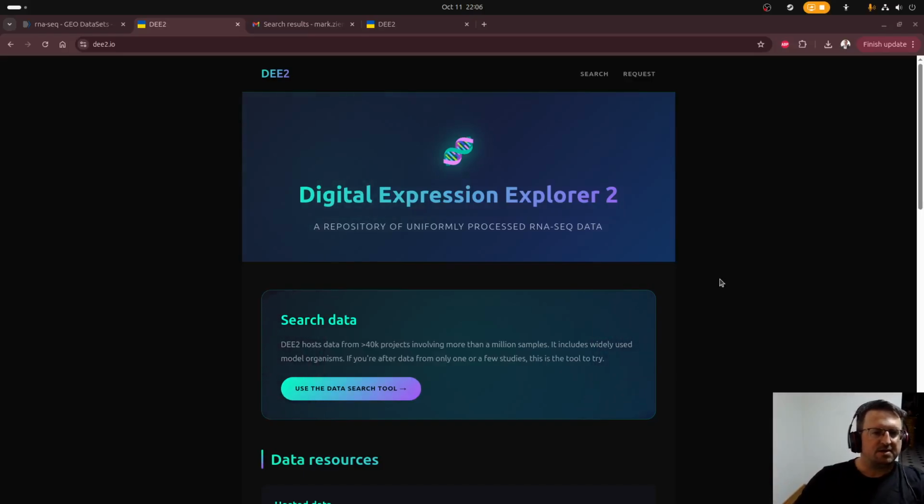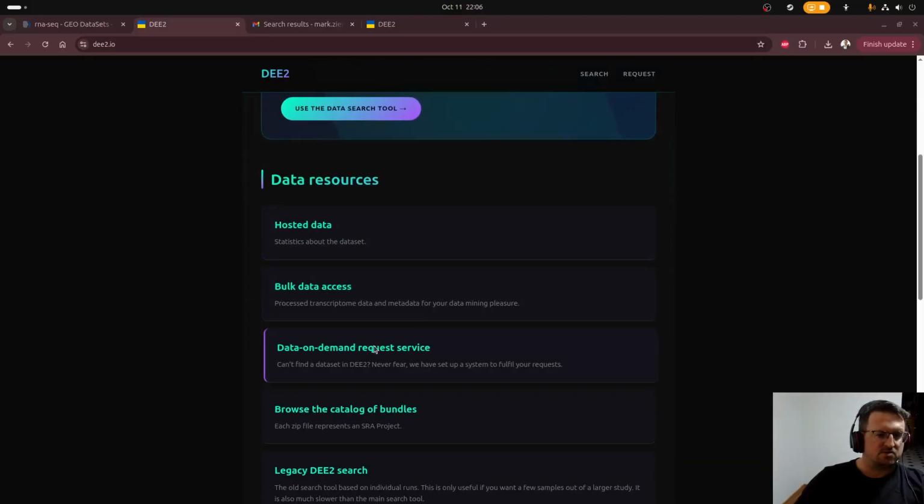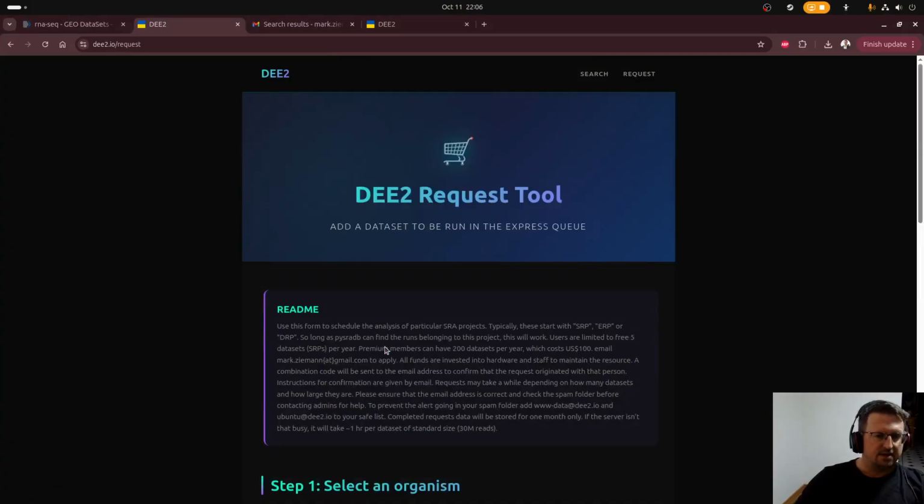In this video, I'm going to give you a rundown on one of the newest features of the DEE2 web tool, and that is the request feature. You can select it from this menu at the top of the website, or you can go down to this data on demand request service and click here.